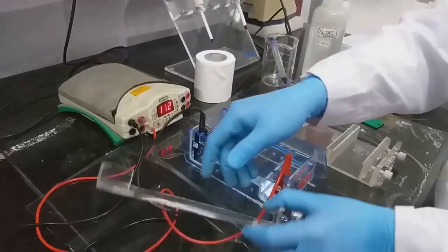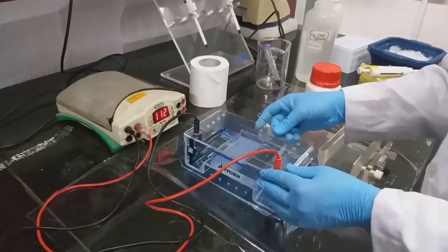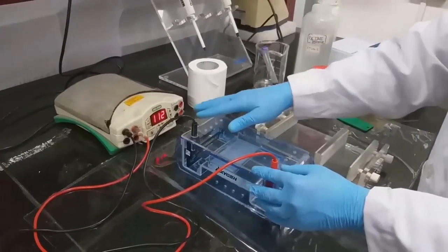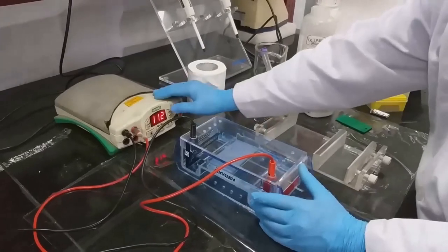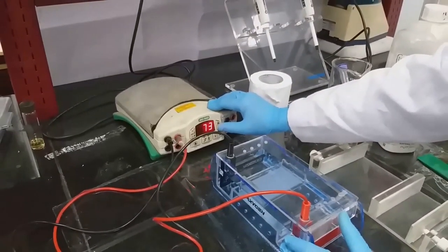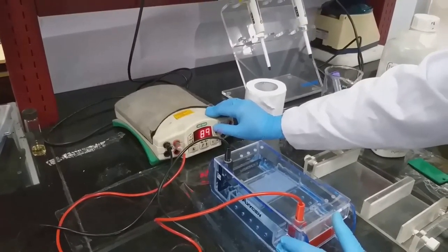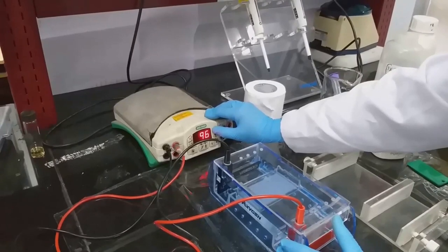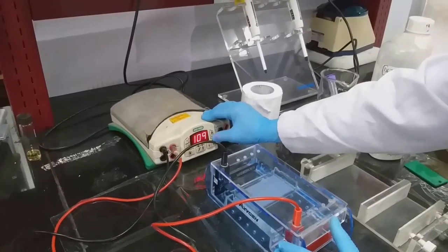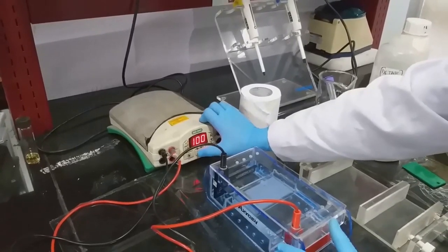The loading is over. We have to cover the electrophoresis apparatus with the lid and adjust the voltage. Then start the run.